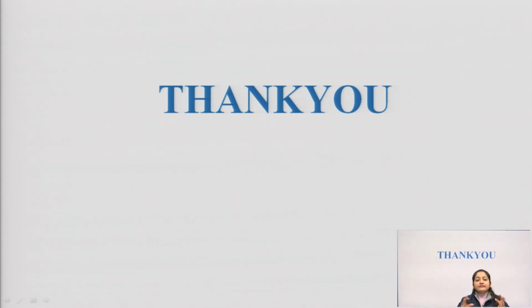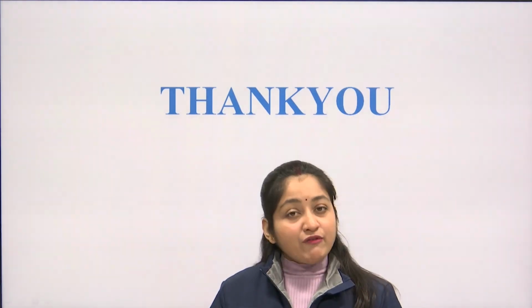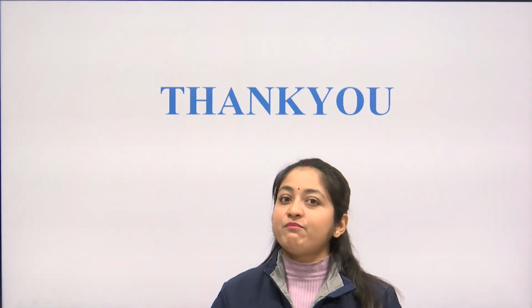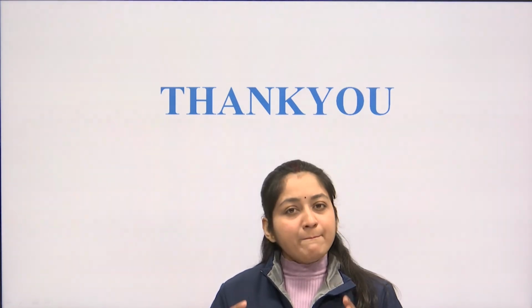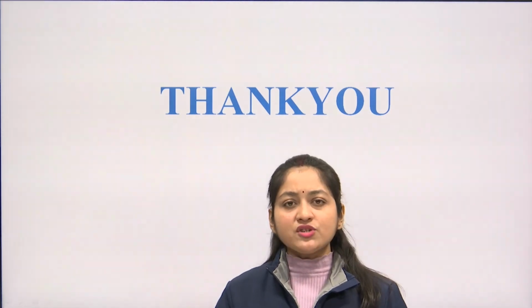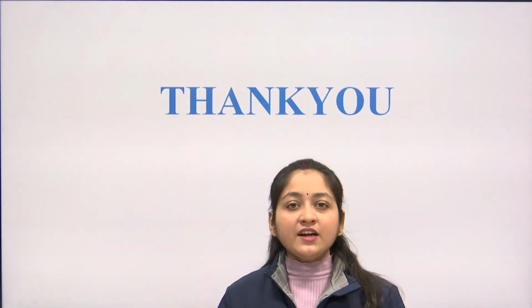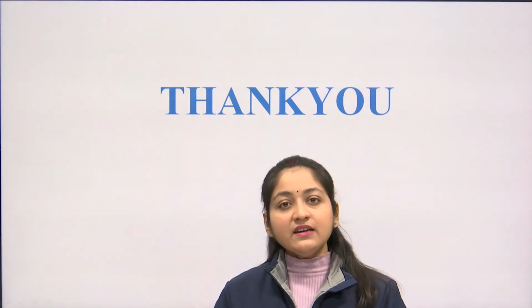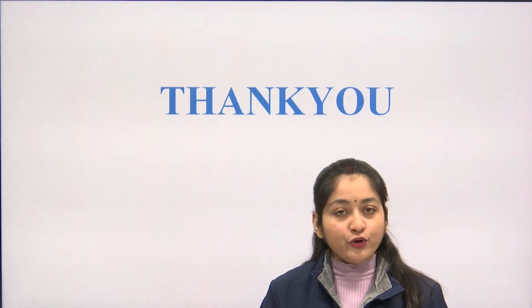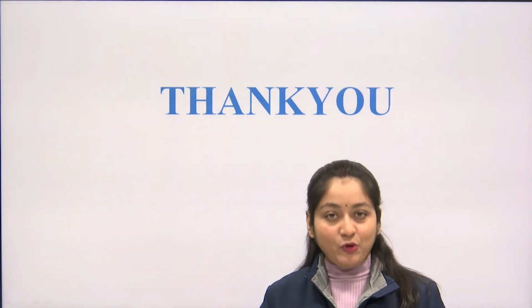So, that is all about the different evaluation parameters of suppositories that we have just seen. That includes the appearance test and other parameters like the uniformity of weight test and the melting range test. These tests are very important, because whatever suppositories you have made, until and unless they are evaluated properly, their efficacy can't be tested, and until you test the efficacy of a particular dosage form, you do not know how good your manufacturing has been. So, that plays a very vital role.